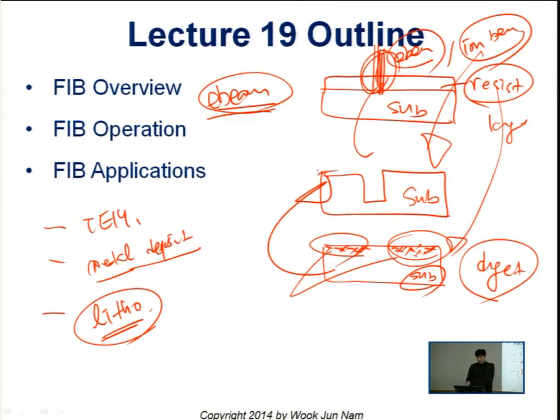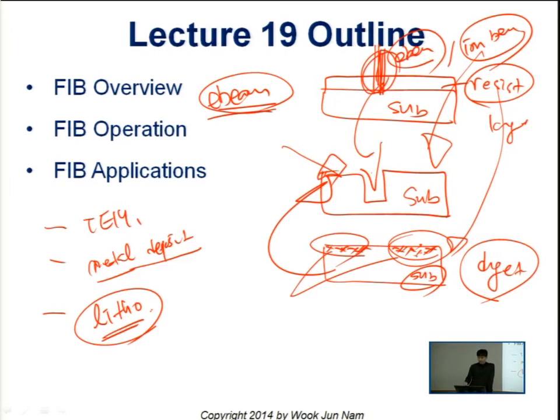A much simpler way to achieve this structure using ion beam is, as I showed you in many examples, to directly sputter out atoms from the substrate. Using that way, using the ion milling, we can just directly remove atoms on the substrate, and then we can make these kinds of structures directly.